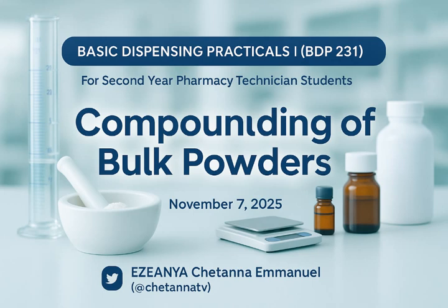Even though I said that due to the situation on ground, if you are writing your label for official use, you don't need to list all the ingredients. Is that clear? But for the purpose of this practical, I'm going to give you the formula on the board. Don't worry, I know why I want you to list it in the label for me. Let me see it. Is that clear? I'm trying to let you know so that in case you see yourself in another setting, you know exactly the right thing to do. Are we together?